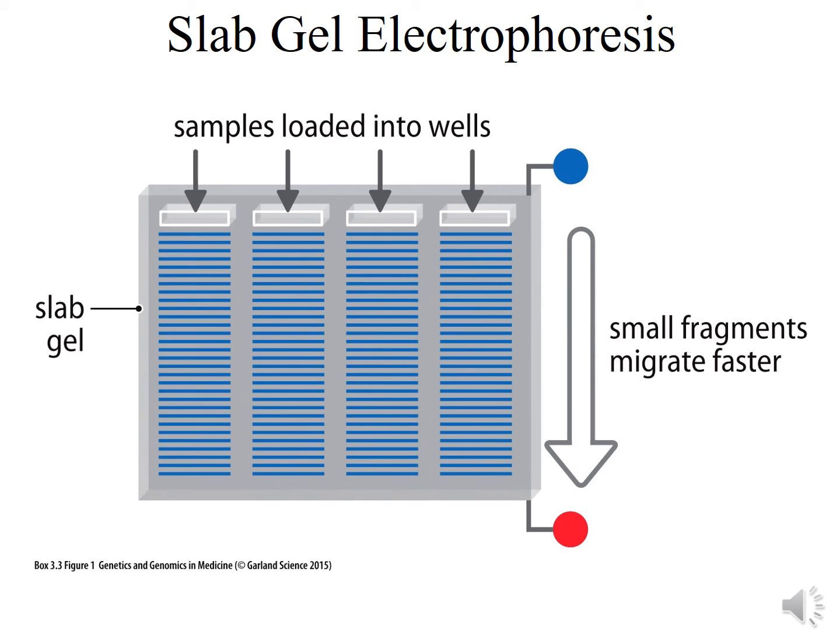In one method, after the end of electrophoresis, the gels can be stained with chemicals such as ethidium bromide or SYBR Green that bind to nucleic acids and fluoresce when exposed to ultraviolet radiation. Alternatively, the nucleic acids are labeled with fluorophores or radioactivity before electrophoresis, and during or after electrophoresis, the individual nucleic acid fragments are detected either using a fluorescent detector or autoradiography with X-ray film.